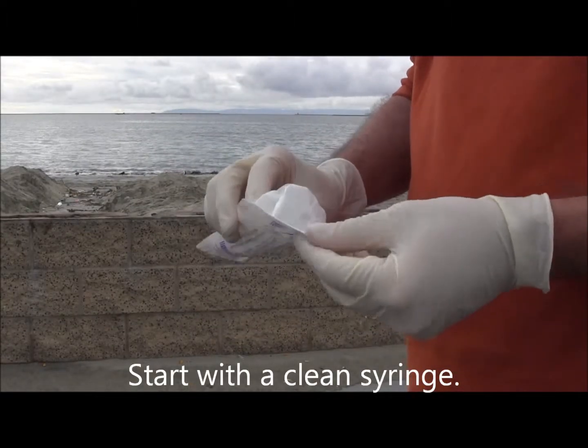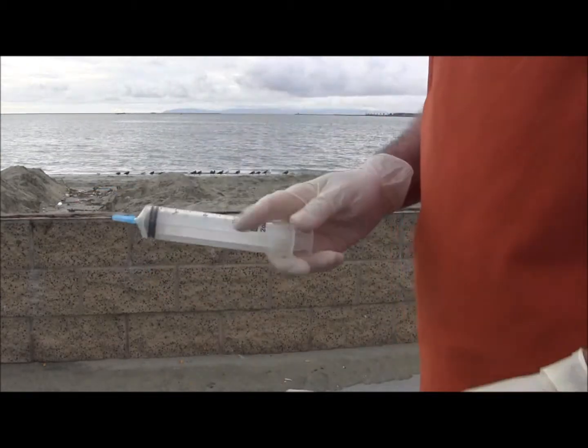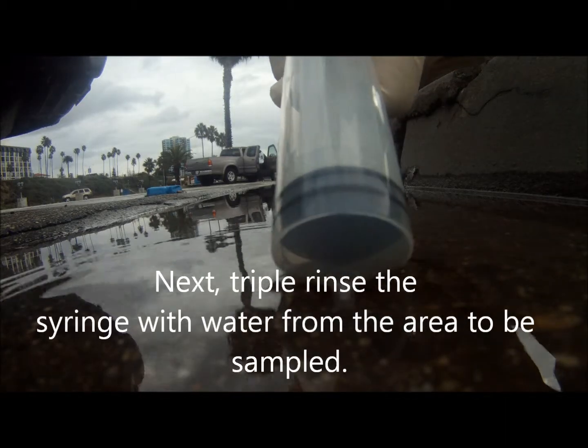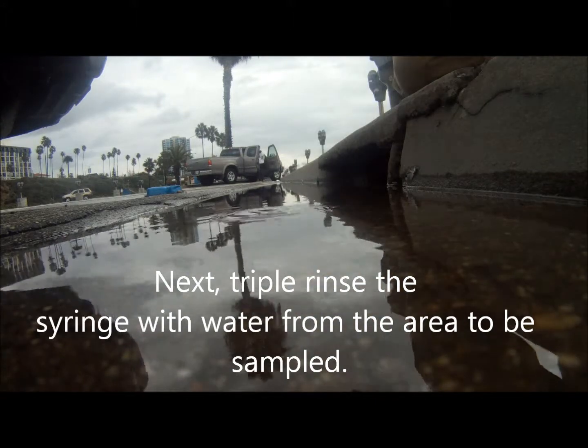Start with a clean, sterile syringe. Triple rinse the syringe with water from the area to be sampled. Always decant rinsate downstream from your sampling site.